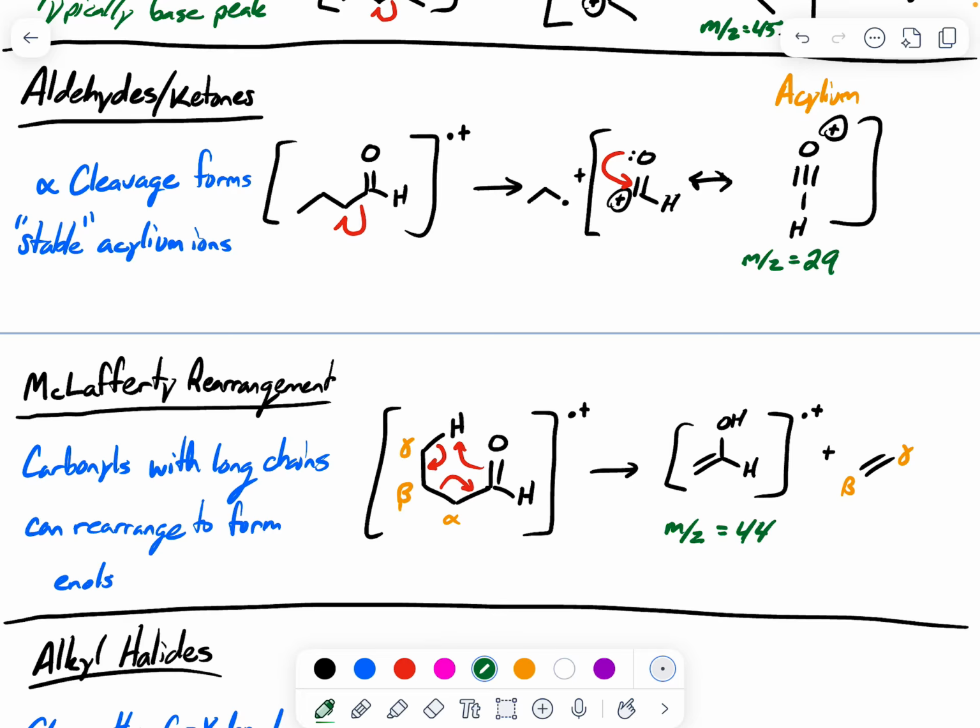So sometimes if you're looking at aldehydes, ketones, all that, and you do not recognize exactly where a specific mass comes in that's not quite the base peak, because that's typically the acylium, it could be the McLafferty that's actually giving you rise to something a little bit heavier.